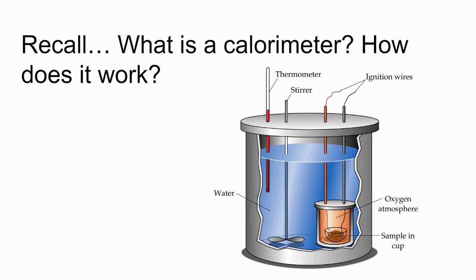But we just need that there. Okay, so that's our sample holder. Whatever food you burn, you're going to put it on here. Then you're going to take your piece of food and put it in our little furnace really carefully so you don't cut yourself. Let me know if you cut yourself. We can get you a Band-Aid.